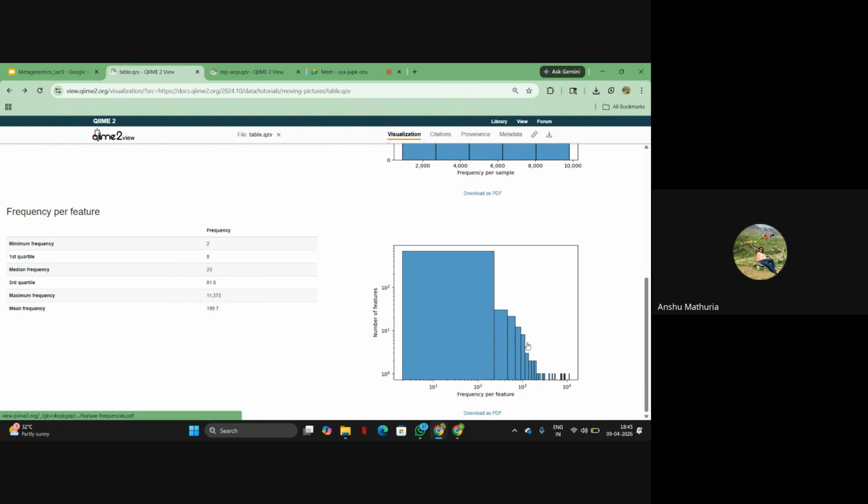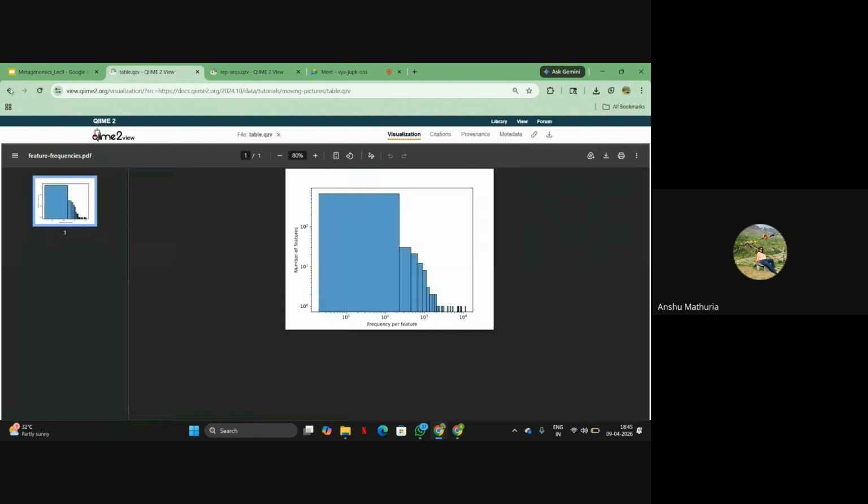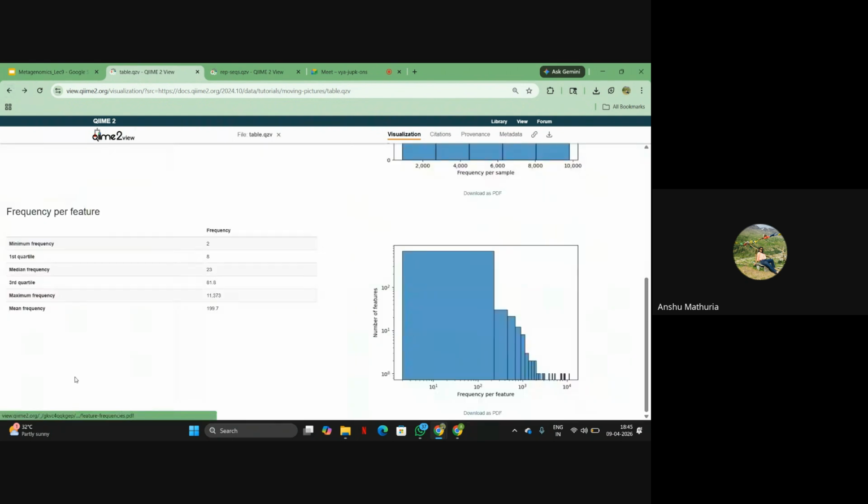We cannot just ignore them, so that is why it is a little skewed, and it is pulling everything upwards here. So this is a pattern that can be seen depending upon this table. Is it clear?